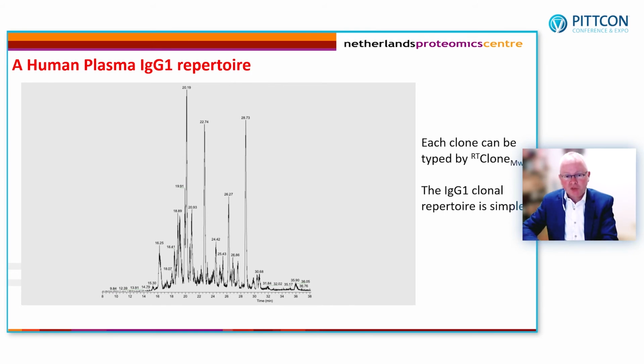Now, if this contained a zillion different antibodies, we would just see a big blob. But the LCMS trace that we measured is really showing us specific features. And if the animation works, yes, here it goes, we walk over this LCMS trace and we measure each time the mass of the ions that come out. These are all Fab molecules, and they all have masses of about 47,000, 45,000. But each time the mass differs by a few Dalton because the sequence is slightly different.